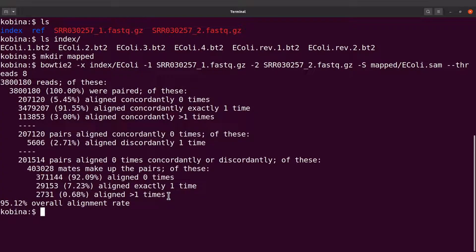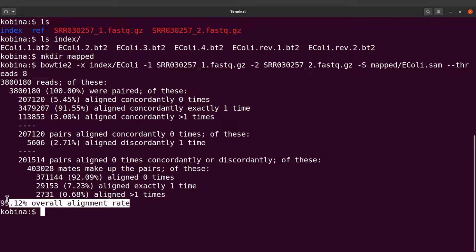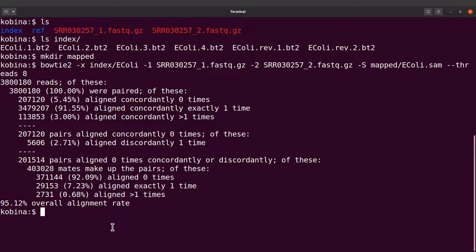I want us to focus on the overall alignment rate. Bowtie says it's 95.12 percent, which is high, so that means things are looking good.